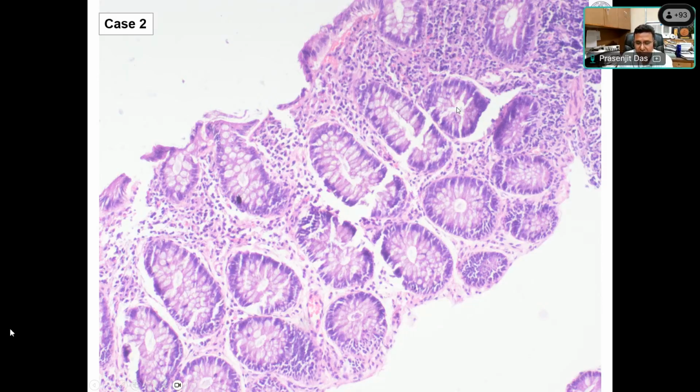So what about the other rule we have talked about? If there is any redistribution of the inflammatory cells or increase in the number of the inflammatory cells? It will be there in the upper portion of the mucosa, sir. So it will be there in the upper portion of the mucosa. But what is present here? It is abnormal or it is normal, like the earlier case? So it is abnormal only. You said the number has increased possibly. Okay, I agree. And there is some redistribution, as you can see, but there is some clustering of the mononuclear cells into the deeper part.